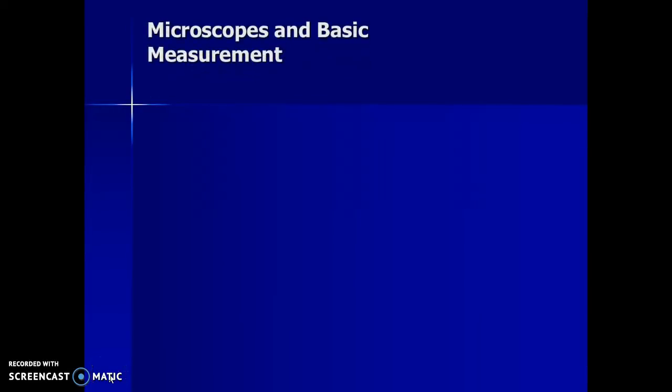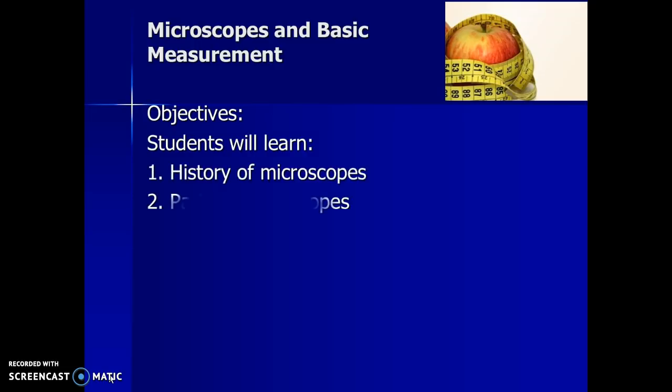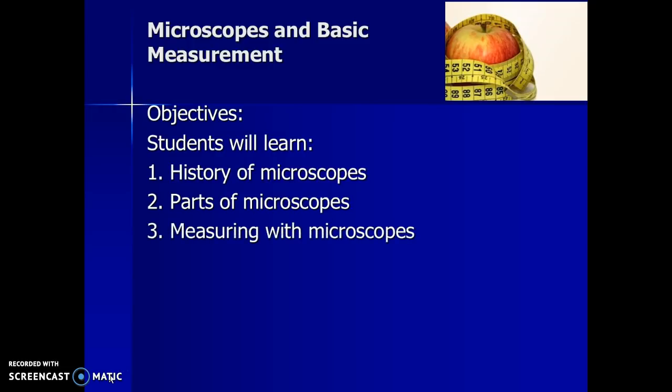Hello everyone. In this lecture, you will learn briefly about the history of microscopes. We will review parts of the microscope, and finally you will learn how to measure objects under the microscope, and how microscopes are used to study the living environment.